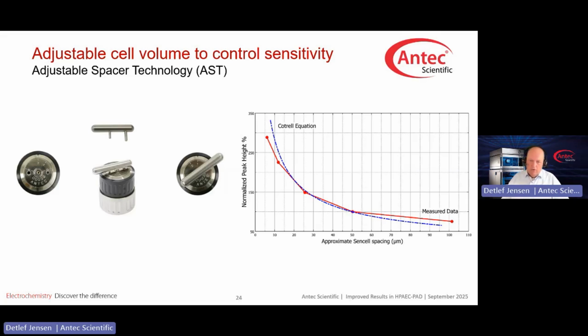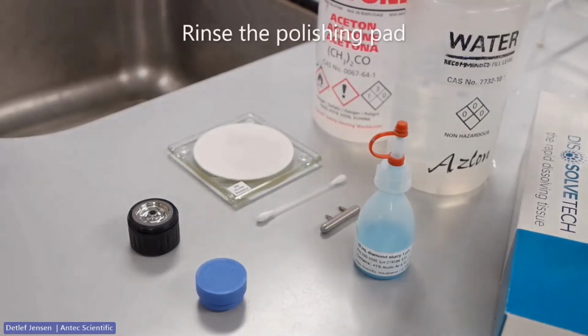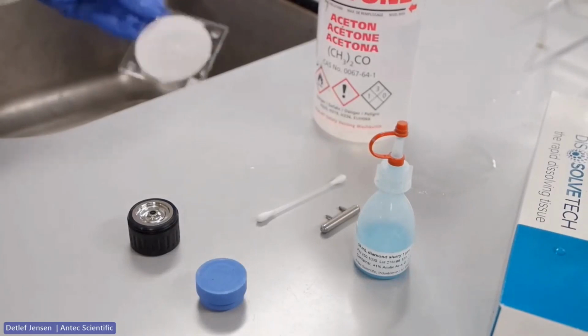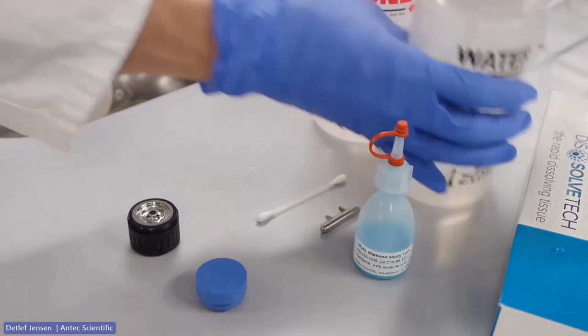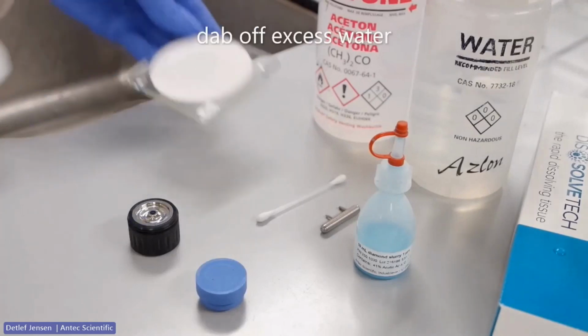Now, even with all these steps, there still might be the need to polish the working electrode. Now, let's have a look at how to polish a working electrode of a Sense cell. Let's talk about how to polish a Sense cell working electrode. First step, rinse the polishing pad. Dab off the excess water.